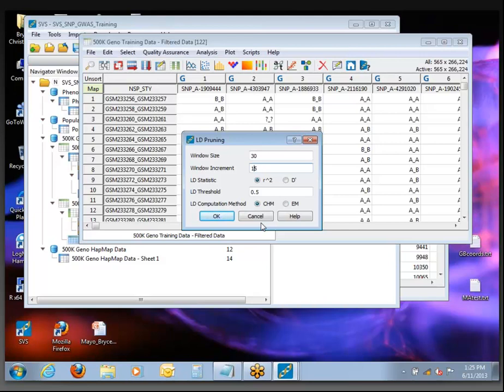That will make it go quite a bit faster. Similarly, we're going to change this LD threshold to be something more restrictive. We'll set it to 0.1 — so any SNPs remaining shouldn't be more than a 10% R-squared relationship with any of the surrounding SNPs, at least within a window of 30.